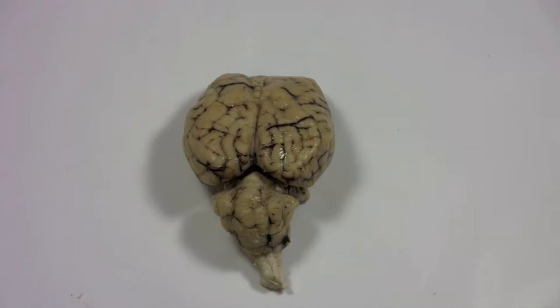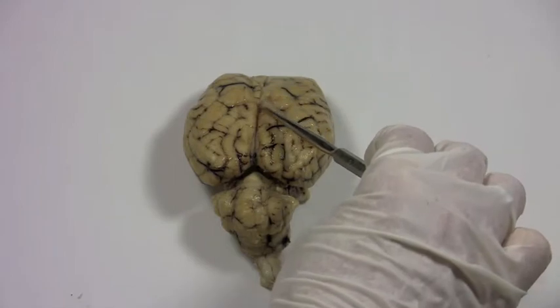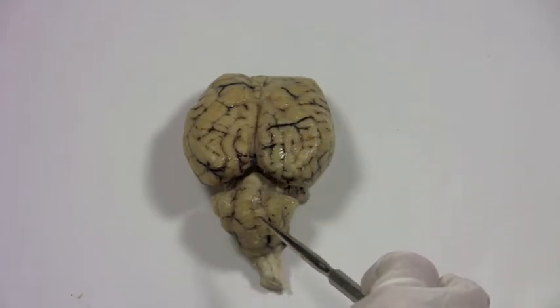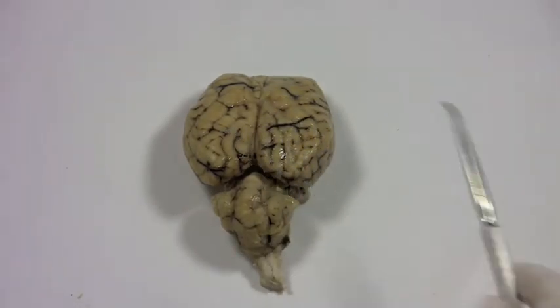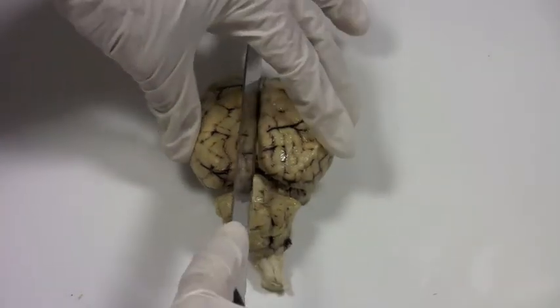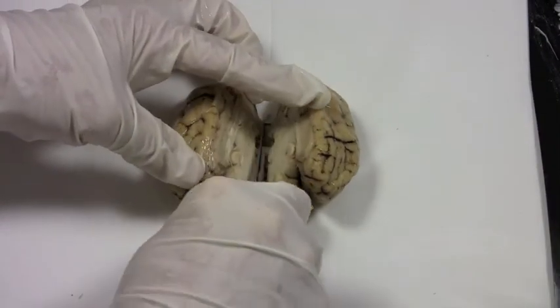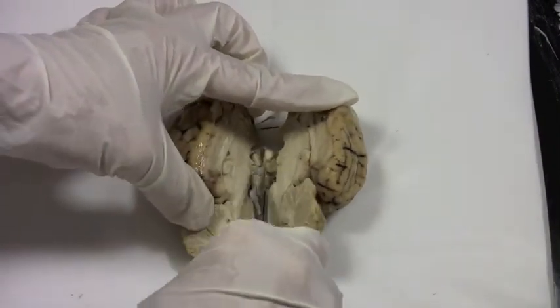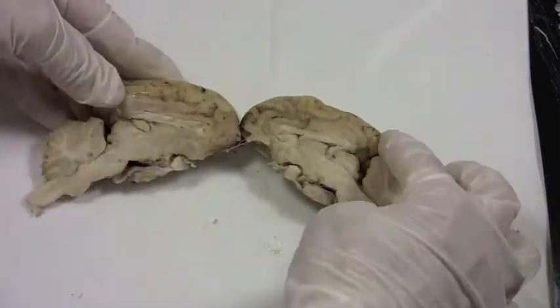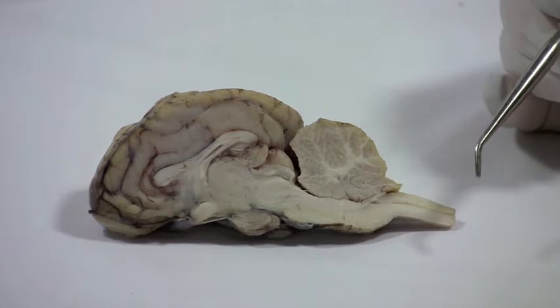To make a midsagittal section, what we want to do is cut right down the longitudinal fissure and divide the brain on midline into two separate halves. Let's take a look at the midsagittal section of the sheep brain.